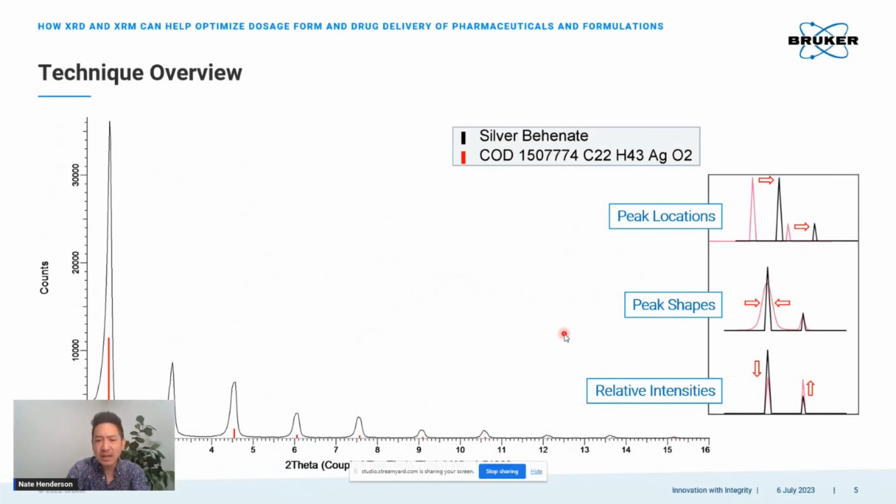And when we look at diffraction data, we don't quite have the same nice, pretty images that we would see from, say, an X-ray microscopy technique. We simply get this line here, and every time we see a peak, that means that there is some characteristic fundamental distance within a crystalline material. So we use things like these peak locations, the relative intensities between the peaks, and then information like the width of the peaks, to massage out some information about what the material is or what the average crystallite size is.